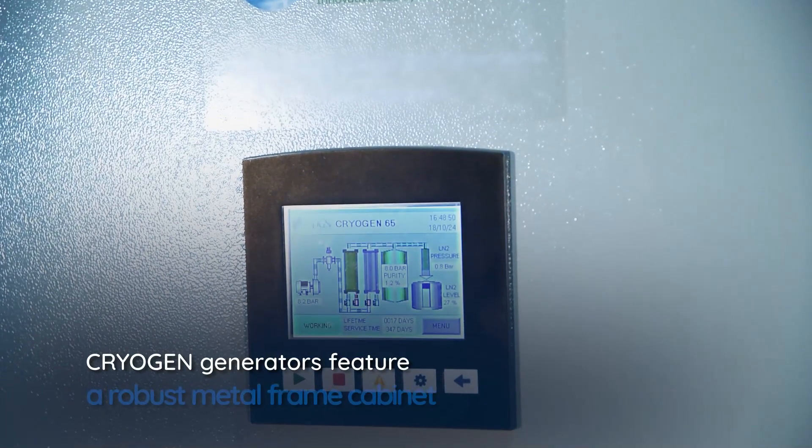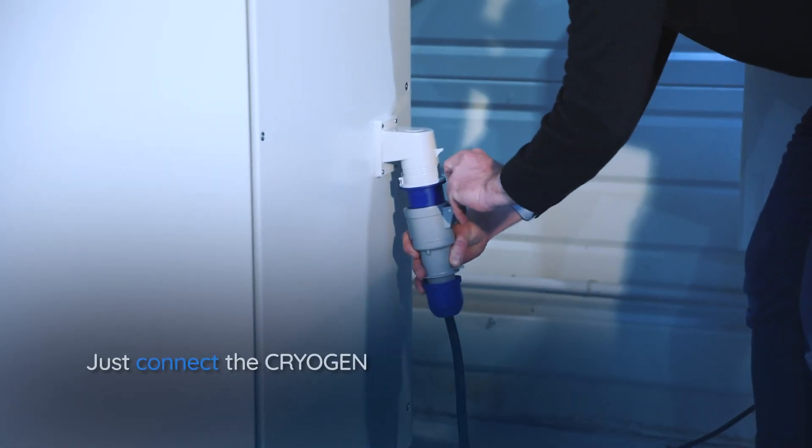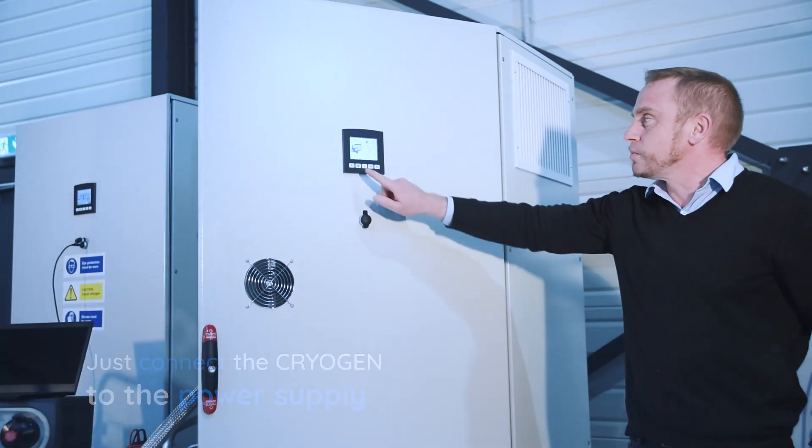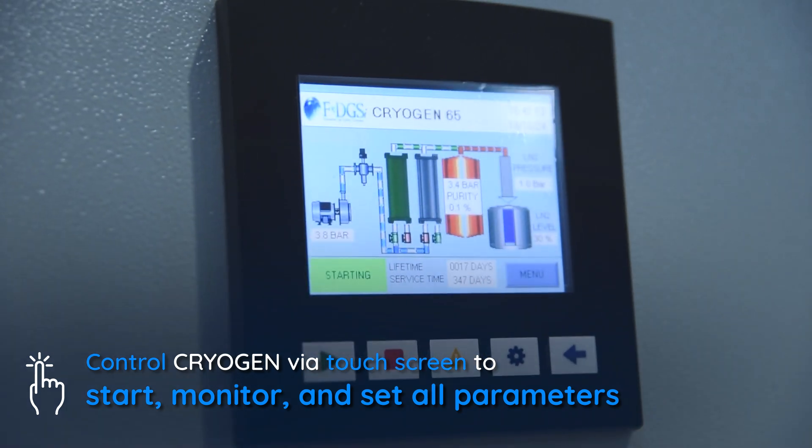Cryogen generators feature a robust metal frame cabinet. Just connect Cryogen to the power supply. Control Cryogen via touchscreen to start, monitor, and set all parameters.